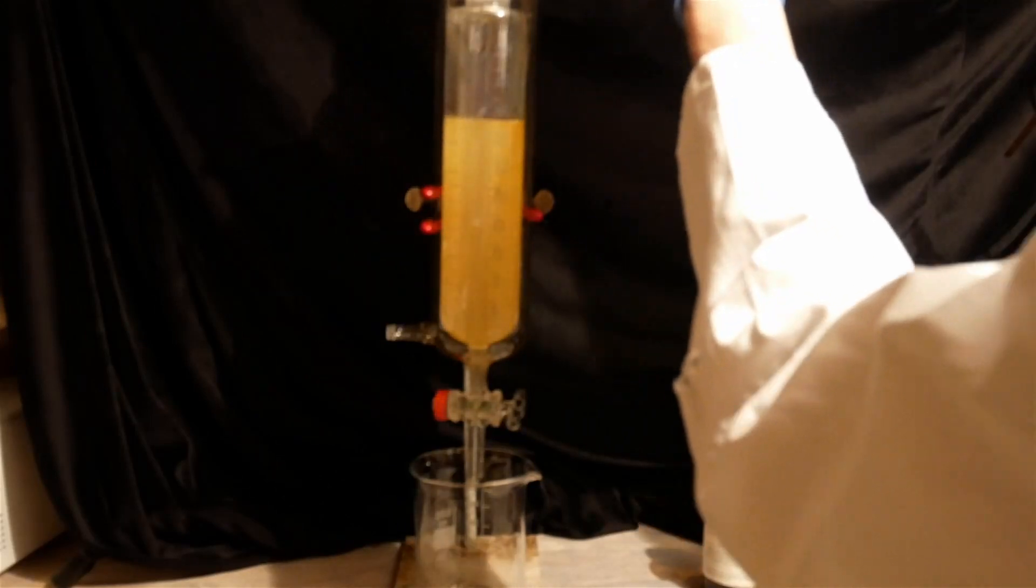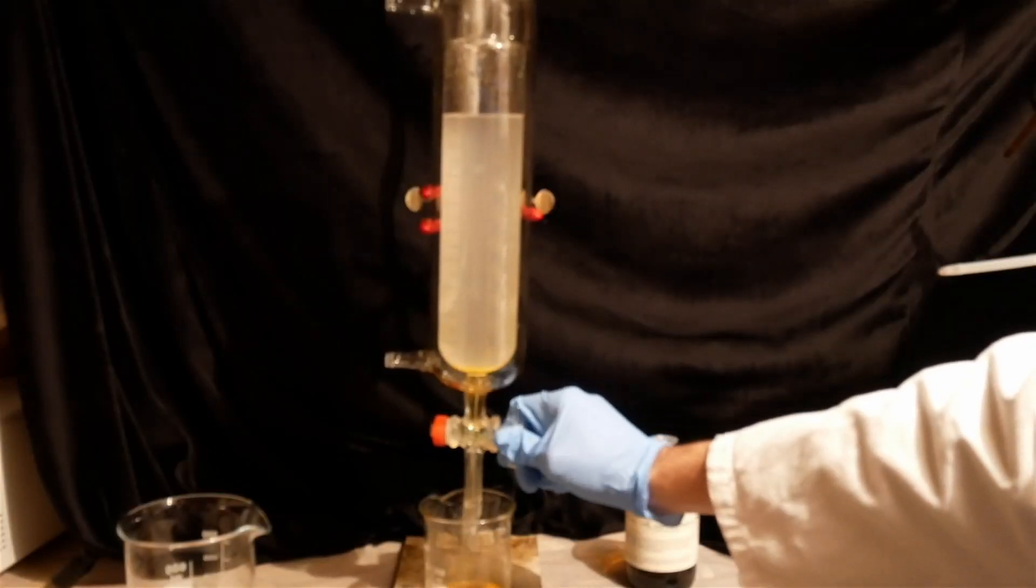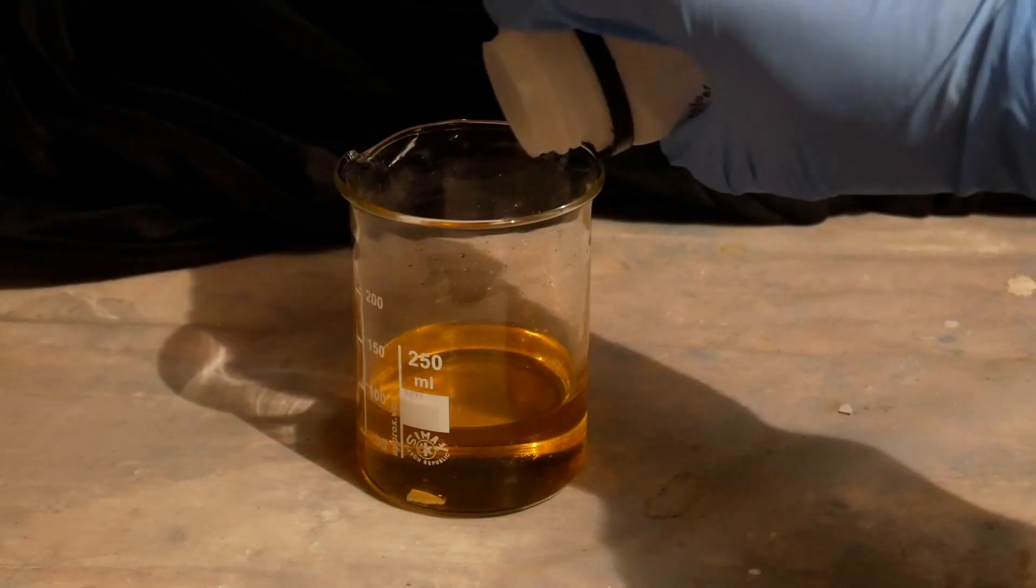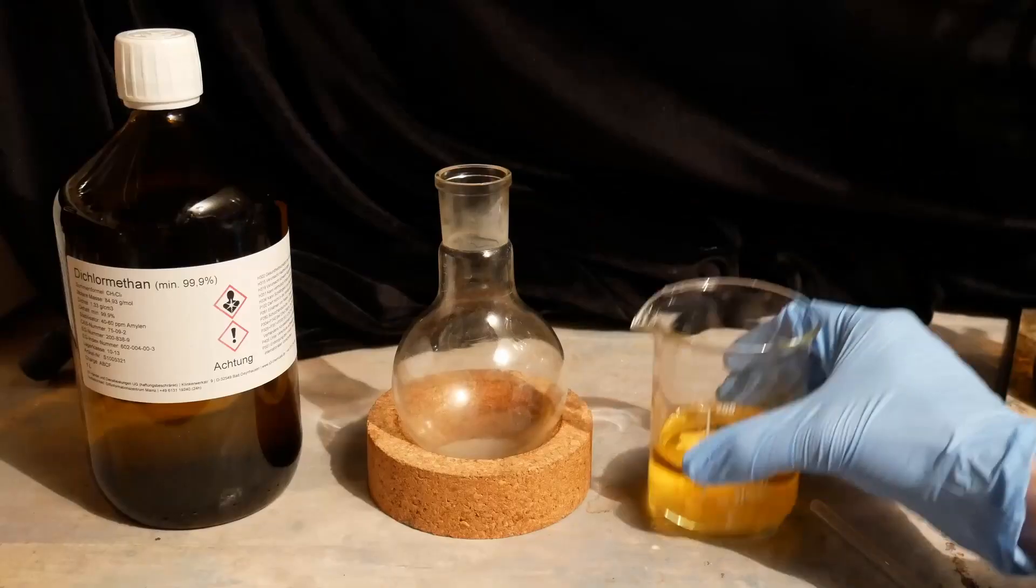The mixture is now moved to a separatory funnel and extracted three times with 50 milliliters of dichloromethane. All of the combined organic phases are then dried over potassium hydroxide and the dried organic phase is transferred to a round bottom flask.